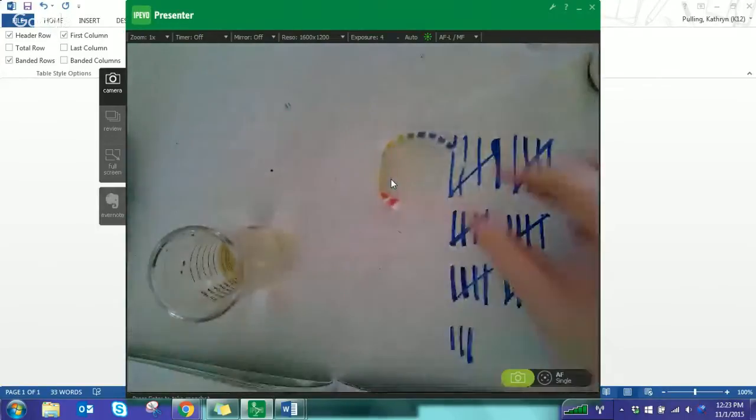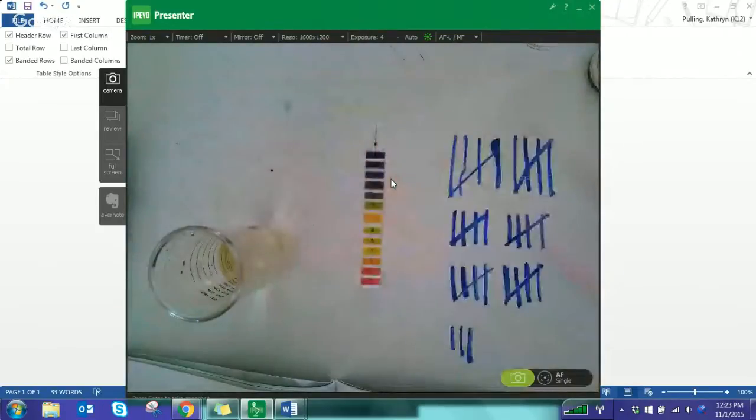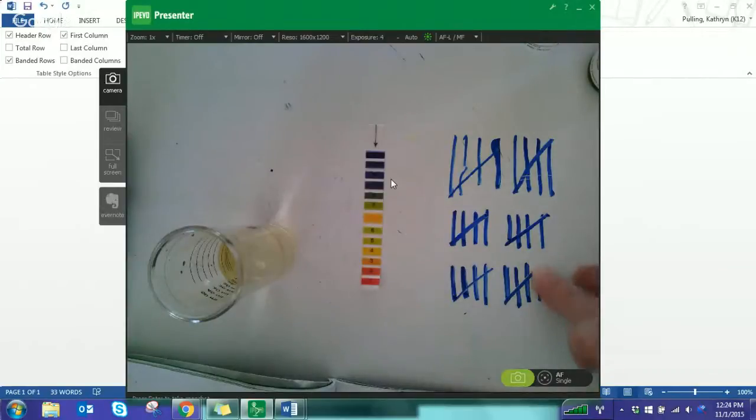Based on the color that I am seeing, it's kind of a bright orange yellow, which I would say would be between 4 and 3. So what that makes me believe is that the lab manual misled us by saying that it should turn red, and really it kind of turns yellow. So I'm going to erase back to 28 and call that my number of drops. That's when the color change originally took full effect, right?